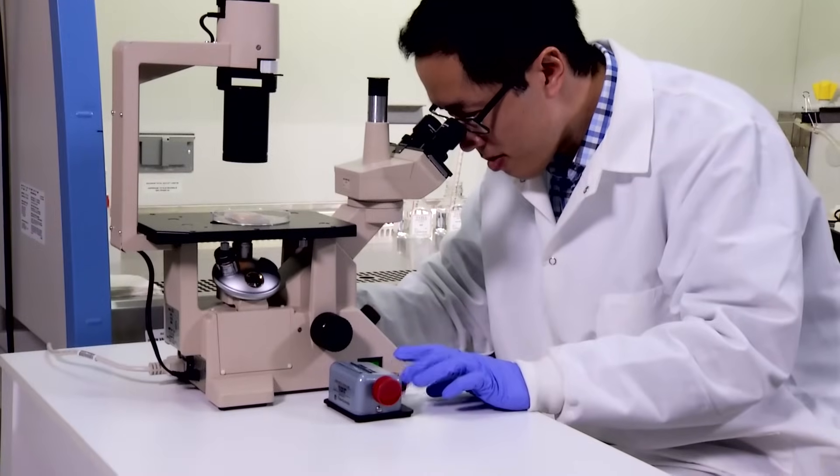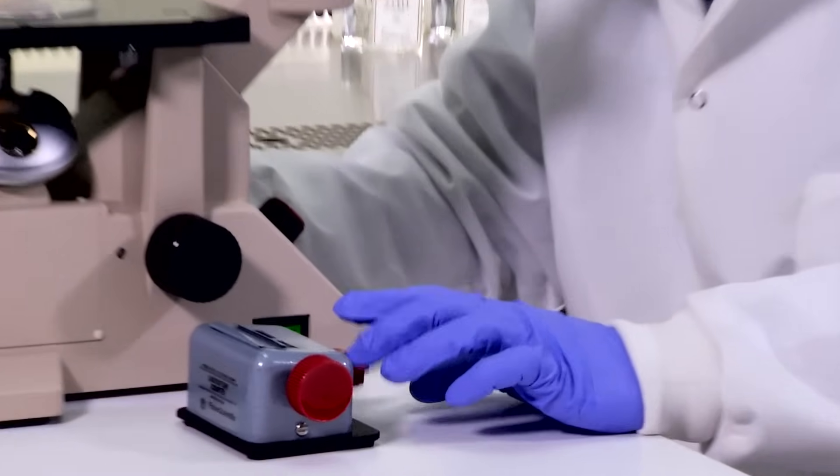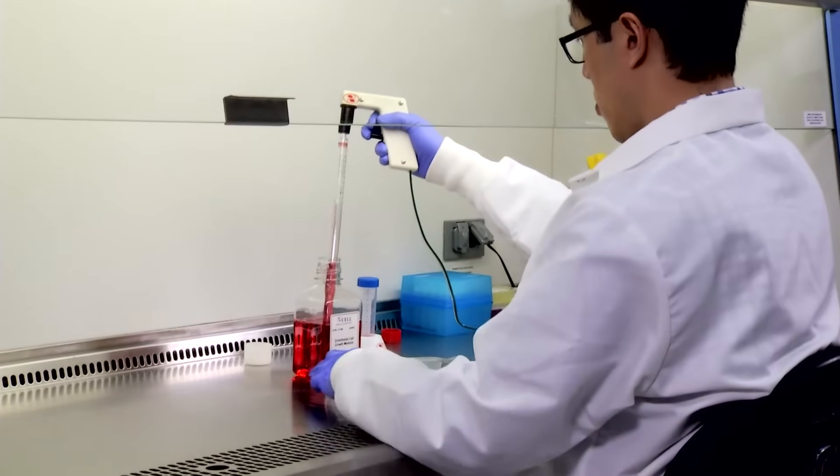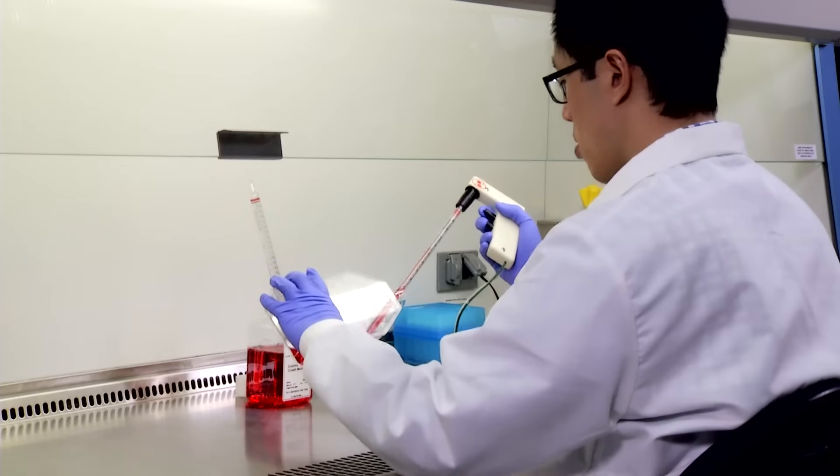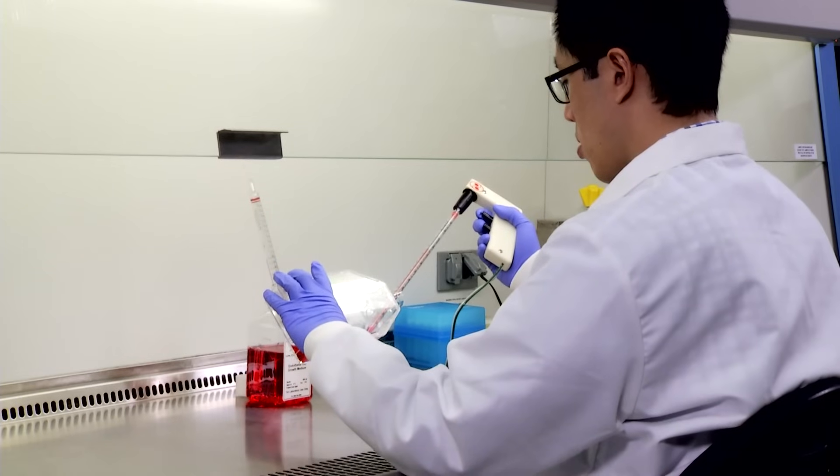Count cells with hemocytometer or cell counter. Pipette 30 ml growth medium into T175 flask. Transfer to flask at 5,000 cells per square centimeter.